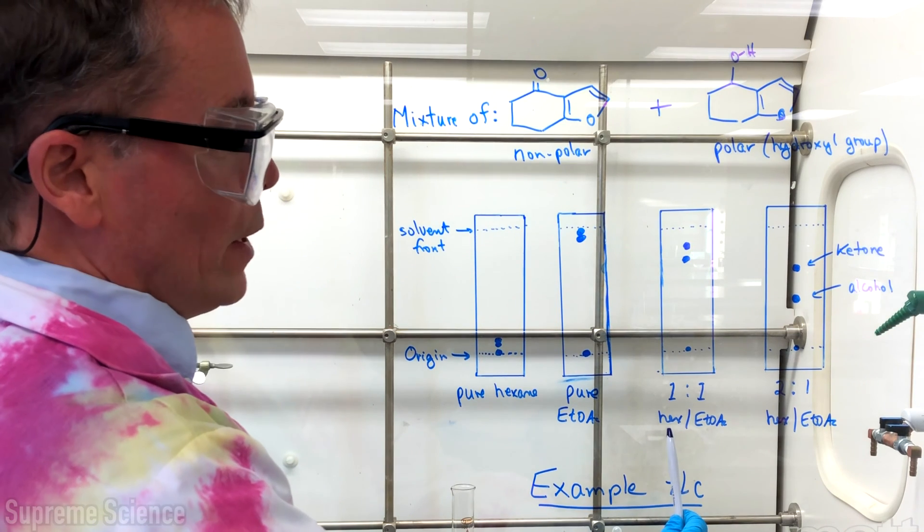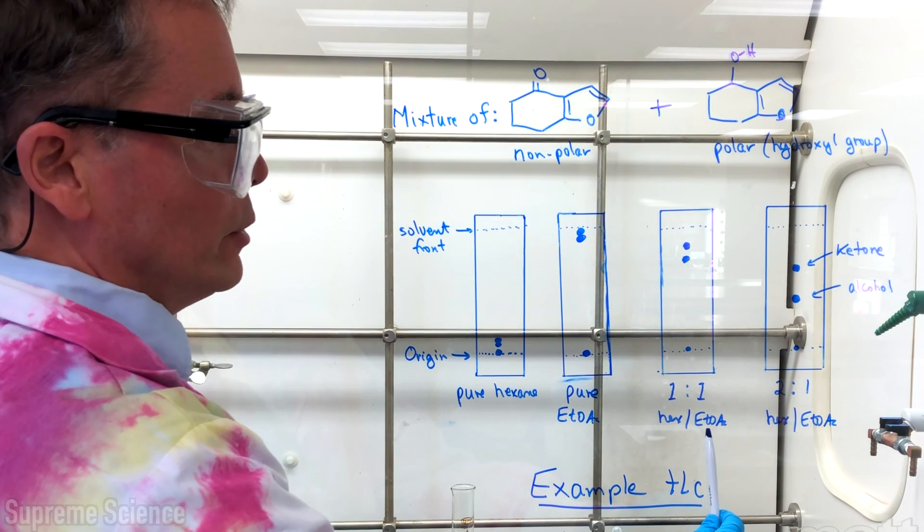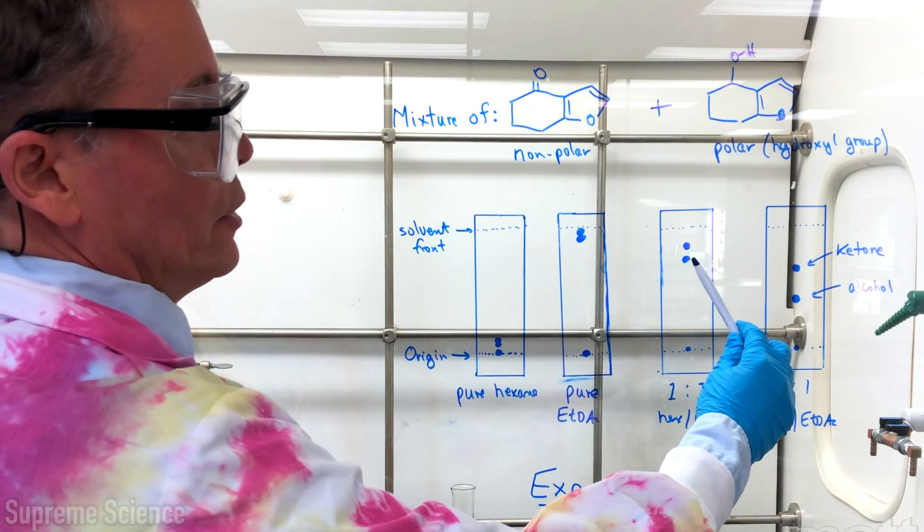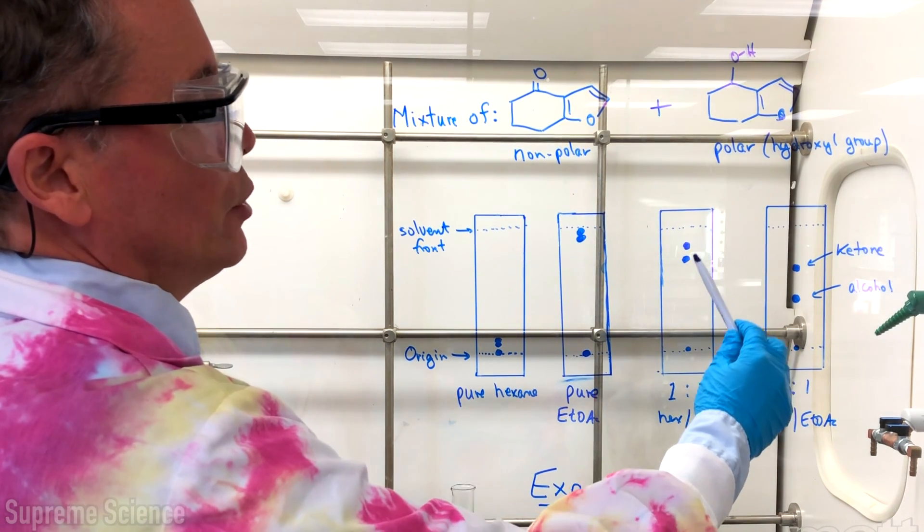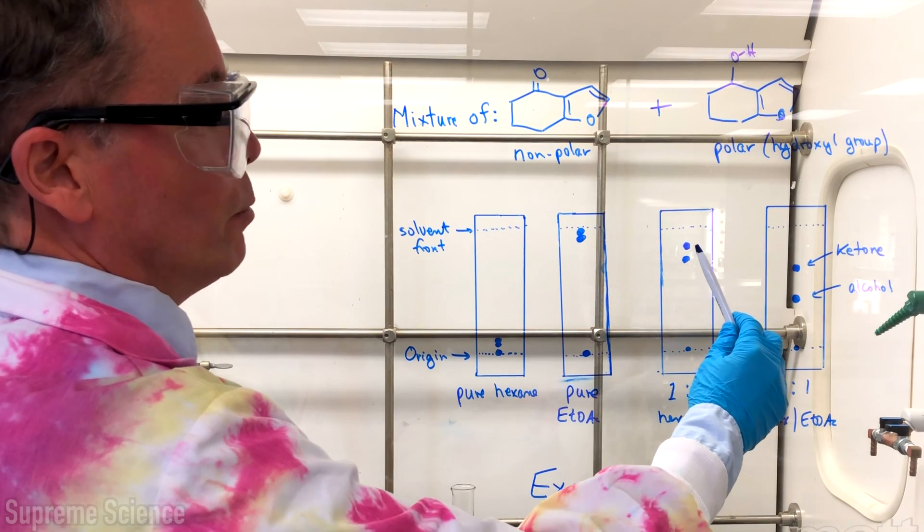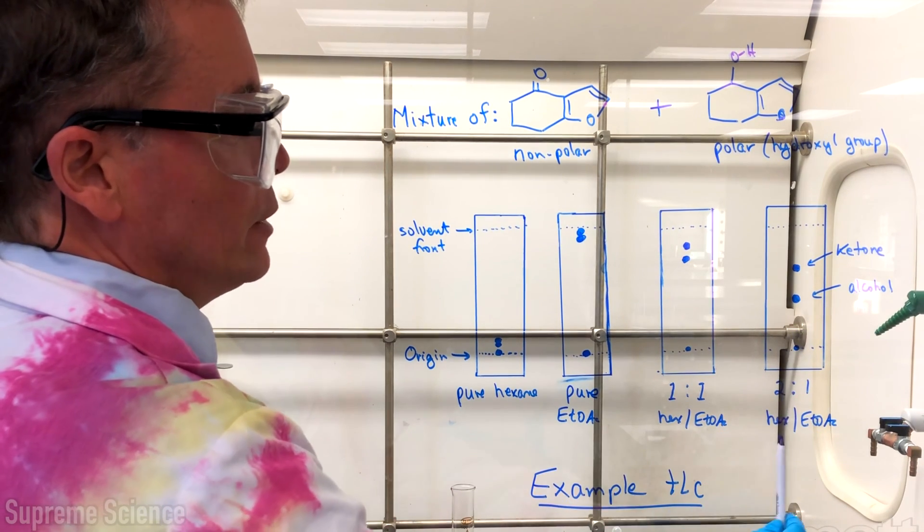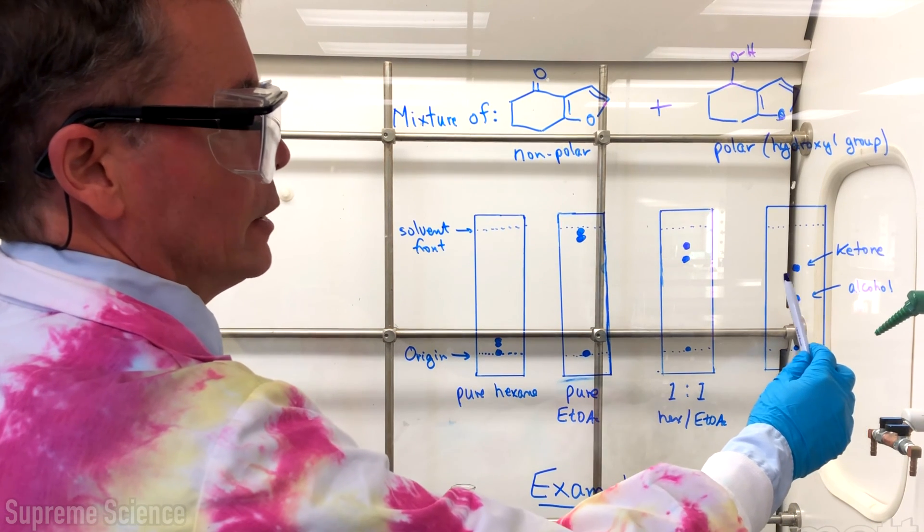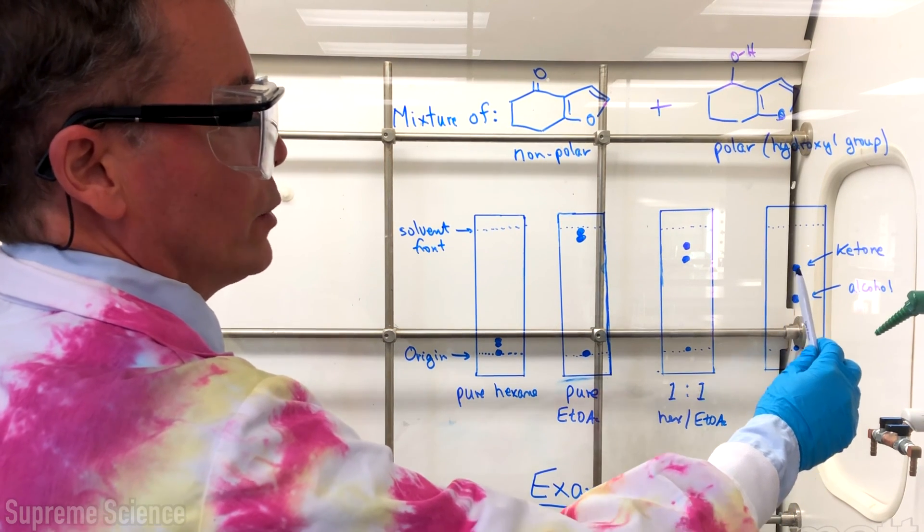So we try one-to-one mixture of hexane and ethyl acetate in our TLC chamber and this puts our spots, they're separating but they're a little bit too far up so we want to bring these spots down. We add a little bit more hexane so in two to one hexane ethyl acetate the spots are a little further down the plate and well separated.